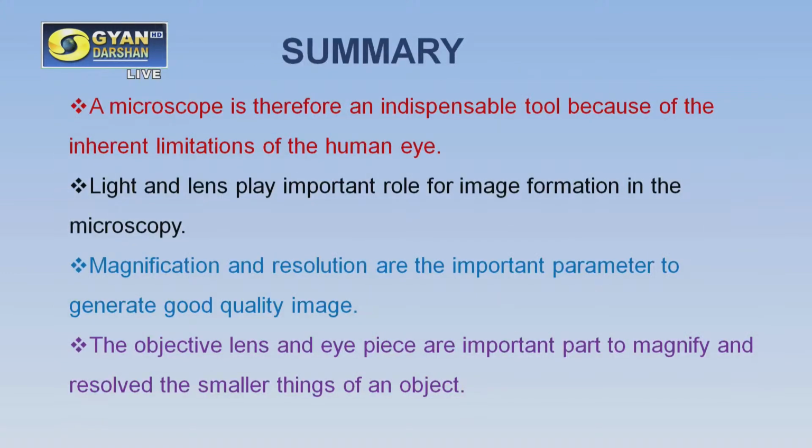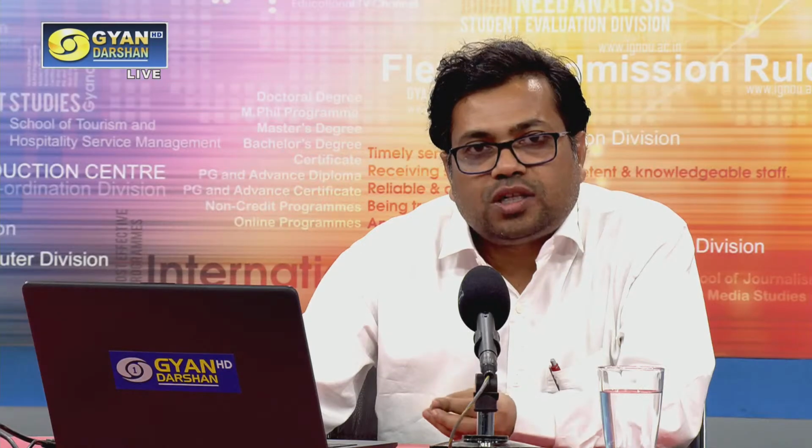So this is the summary. Now you understand the different kinds of microscope, their principle and application, magnification, resolution, refractive index, and so on. This session might be helpful to understand the basic principle and theory of the microscope.